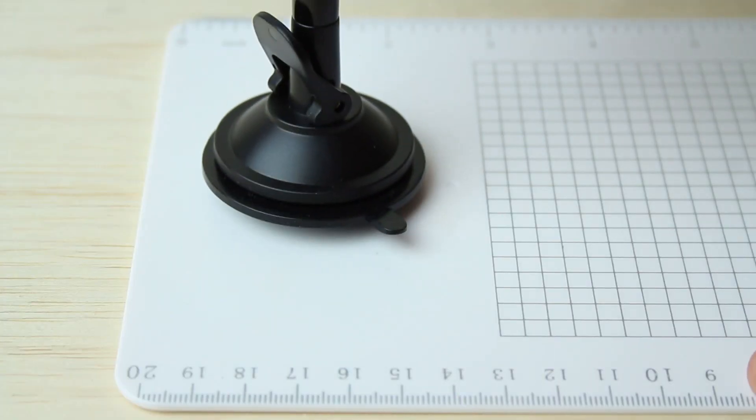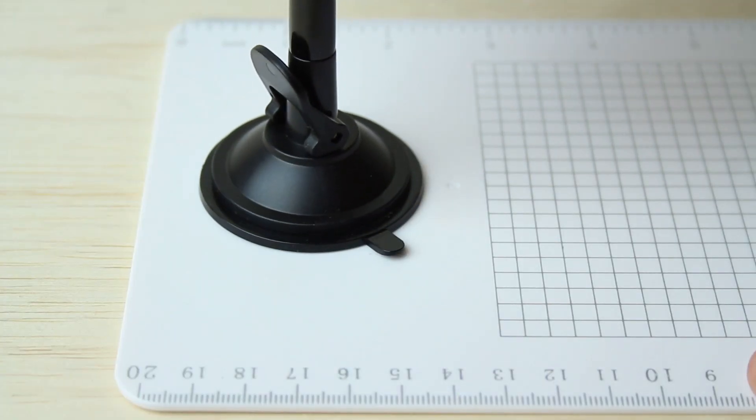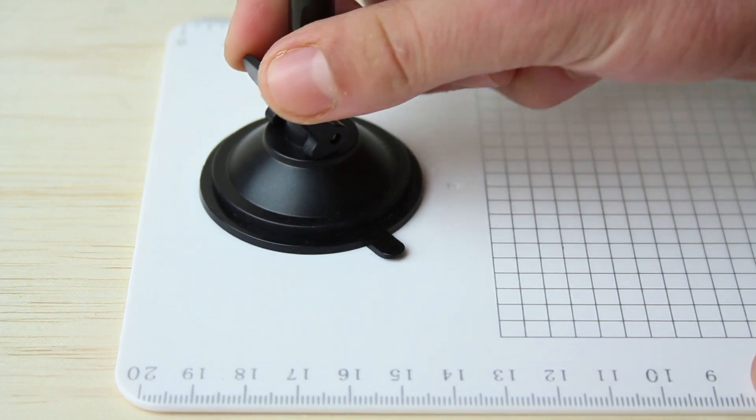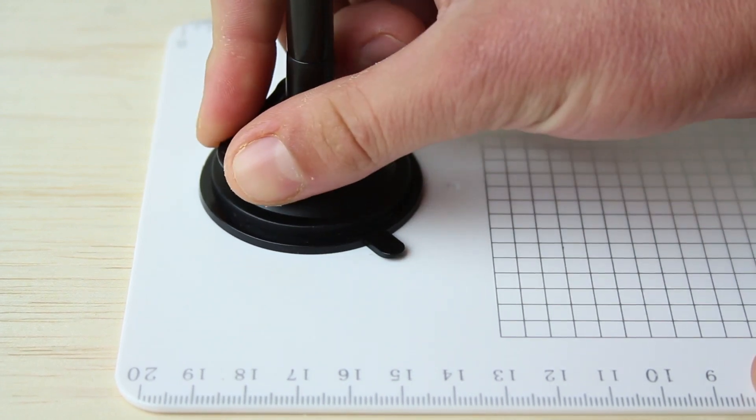Place the suction cup on the observation grid, press down, and secure the suction cup lever.